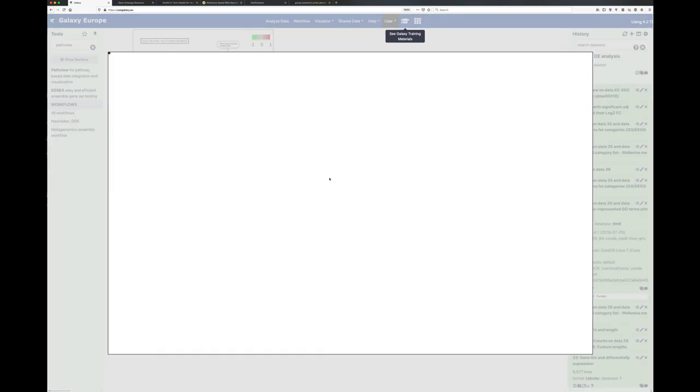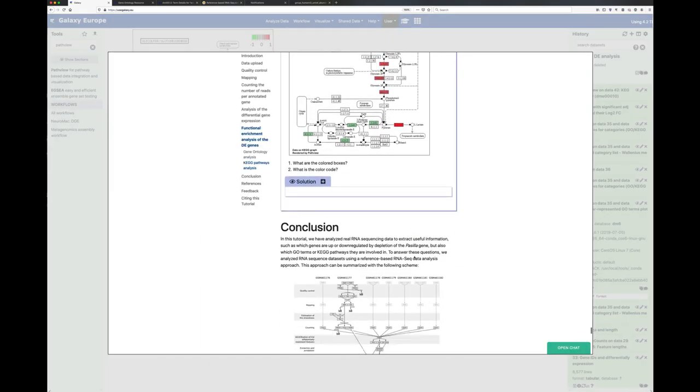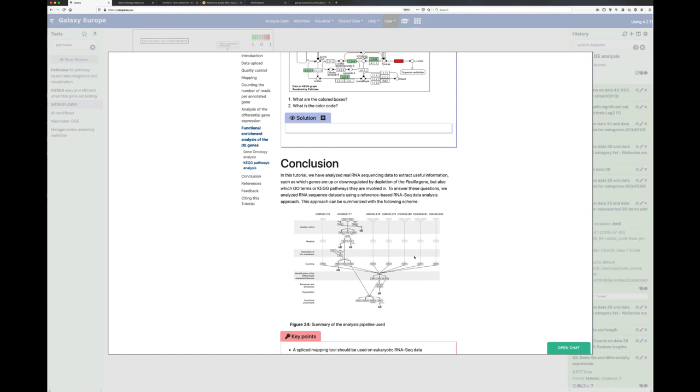On that, I think we covered, in these tutorials we took real RNA-seq data, and we did several steps for this data set. We did a quality control, we did a mapping, we did some estimation of the strandedness that is useful for counting. We did then a differential expression analysis with DESeq2, where we took all our 7 samples, because the first steps we did it only on 2 samples.